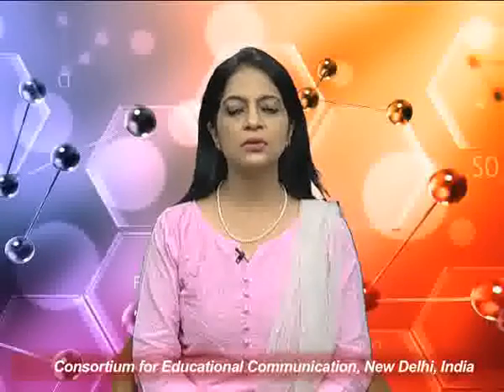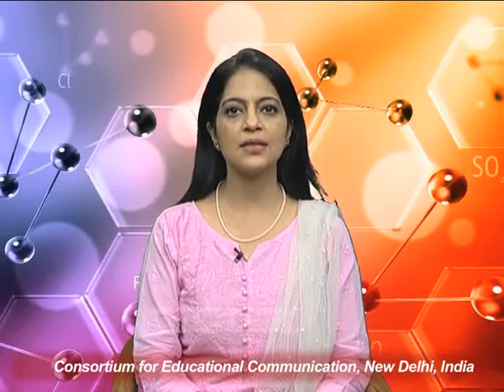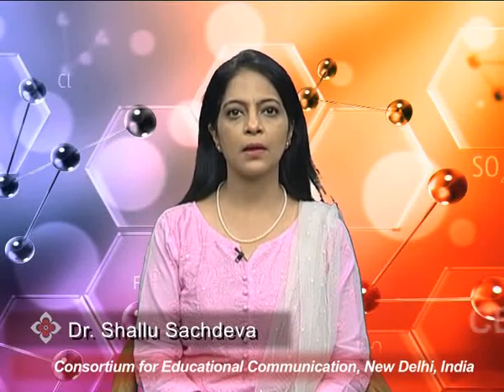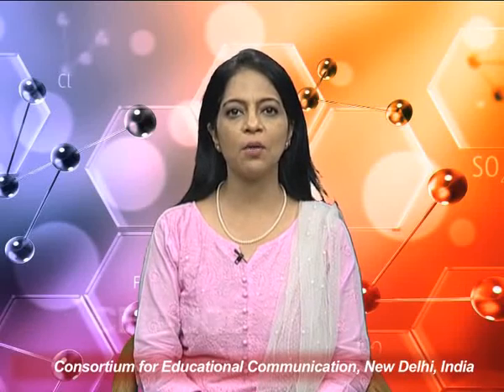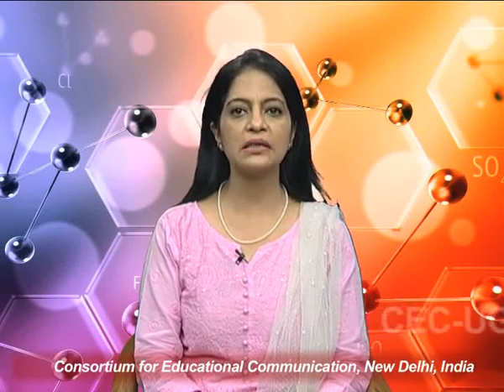Welcome students. In continuation with our previous lecture, we were discussing examples of direct titrations, wherein we had discussed the lead tartrate complex, in which tartrate is called the auxiliary complex former.